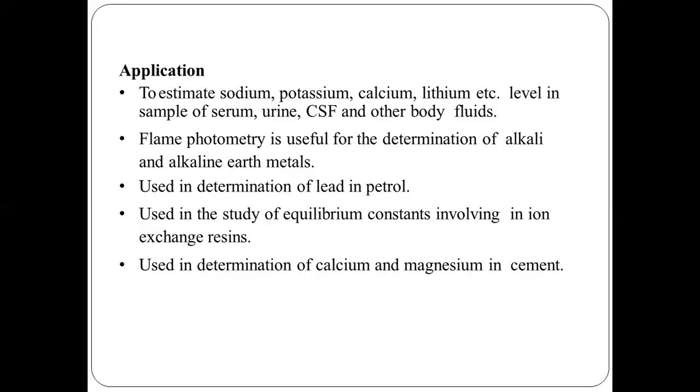In today's lecture, we studied the flame photometer. First, we studied its introduction, and after that, we studied the diagram and the different components of the flame photometer, with a brief study of each component. And at last, we studied the uses, or applications, of the flame photometer. Hope you understand all about the flame photometer.